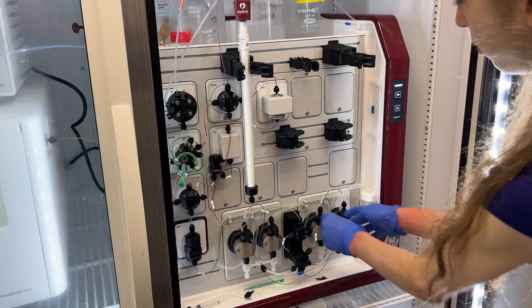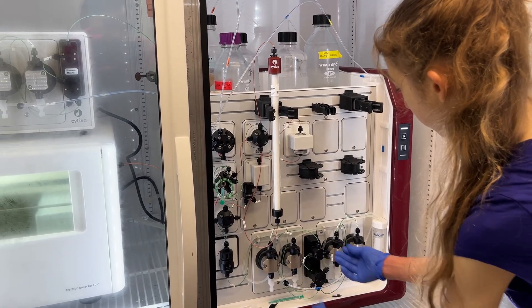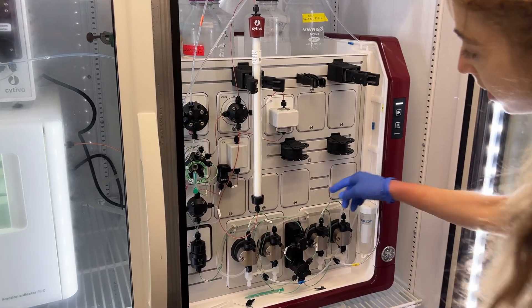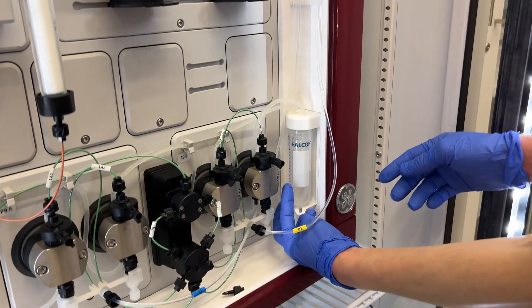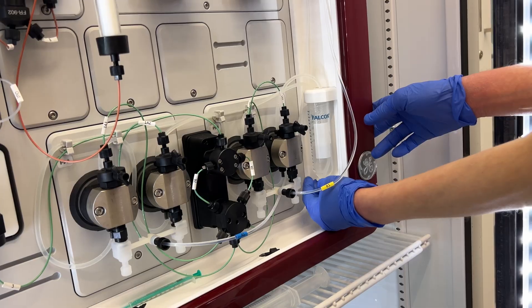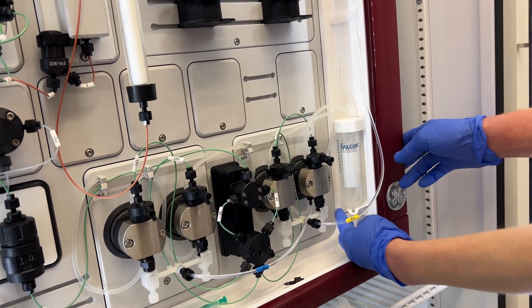You always want to prime the lines — that primes the line and it primes the pump, and you don't want there to be air bubbles in these lines. These lines go into a tube that contains 20% ethanol, and you want to replace it about once a week if you're using it a lot, or every couple of weeks at least.